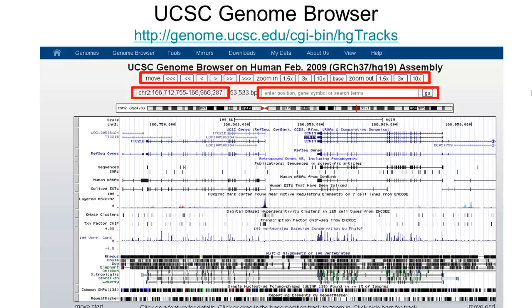Once you land at the genomic location, you can move in the 5' or 3' direction or zoom in and out. One word of caution is that whenever you communicate with someone else about genomic coordinates, make sure you specify the version of the assembly you are referring to. The so-called reference genome is not static. It gets updated once in a while as new sequence data becomes available. Most people now use GRCh37 or hg19, but some people and some programs still use hg18, which has different coordinates.